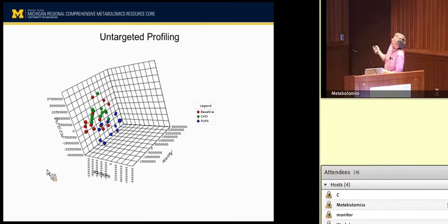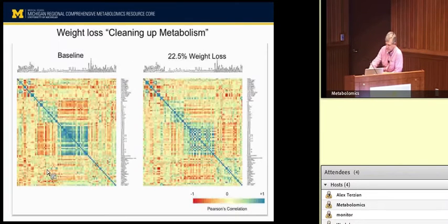This is some untargeted profiling that was done. Just real briefly, these are the named compounds in the untargeted, and this is partial least squares. Again, you're getting some separation, although it's not a really great separation with the untargeted platform. It's unclear exactly why it doesn't change as much. These tend to be much more polar compounds, at least for the first part of the chromatogram. There's a little bit of separation in partial least squares, but there's not a lot of things that drive this reproducibly. So that's how you can use these tools.